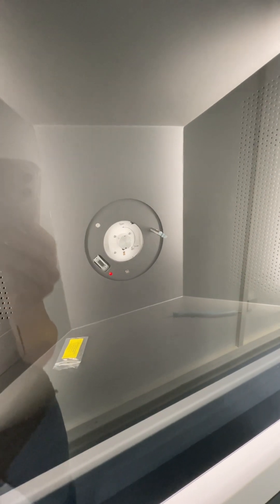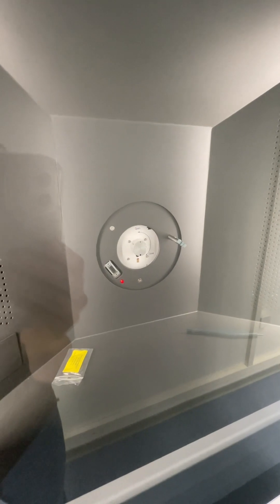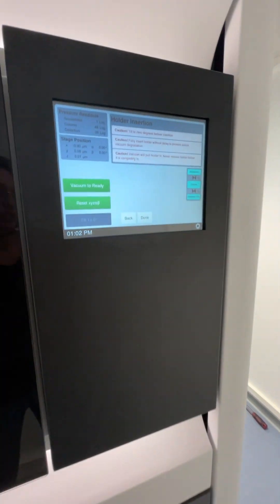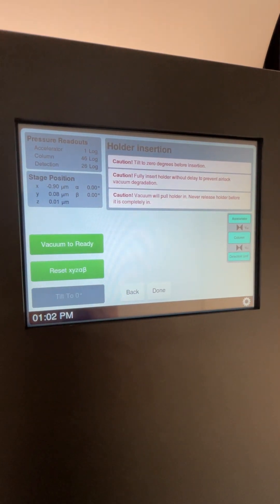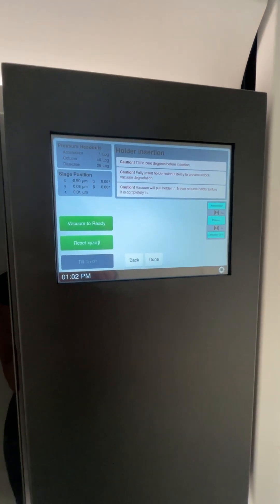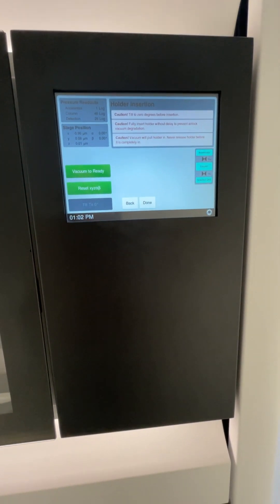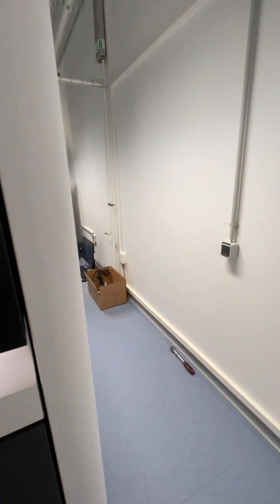Users will come in and load their sample into the holder, then the holder into the microscope. Right now this is a side entry port — we have a dummy in and the microscope is just sitting there. There's also a little screen that guides you through the holder insertion and retraction, which is great because that's one of the most stressful steps for new users. If you don't do it correctly, you can introduce air into the column, triggering alarms and waiting several hours before you can use the microscope.